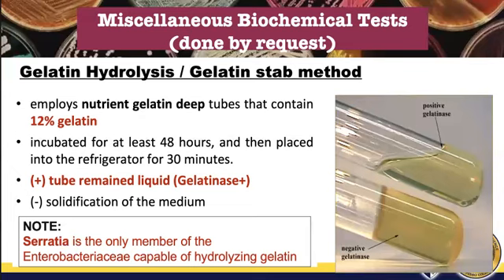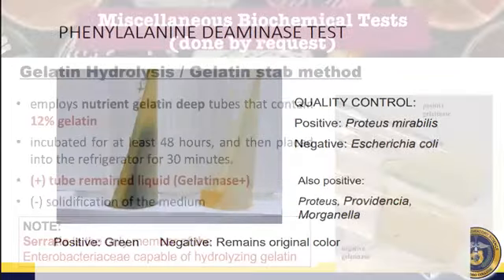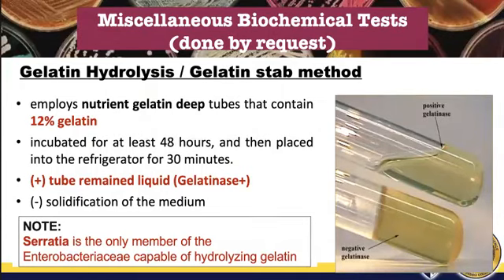So after 30 minutes, titignan mo na ngayon immediately, no? Wag mong tagalan kasi baka slightly mag-liquefy din siya. Okay? So immediately after removing from the refrigerator, check mo, okay? Slightly tilt it, no, to see the difference, okay? So kung dili siya mag-tilt, okay, nag-stable siya in that position for at least 1 minute, o di negative yan.